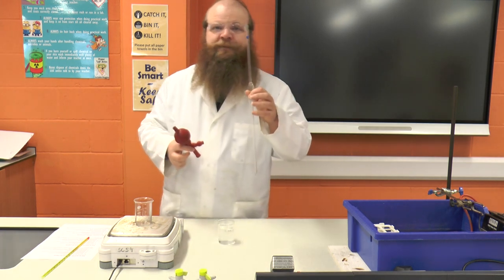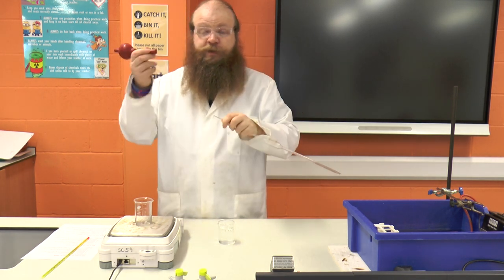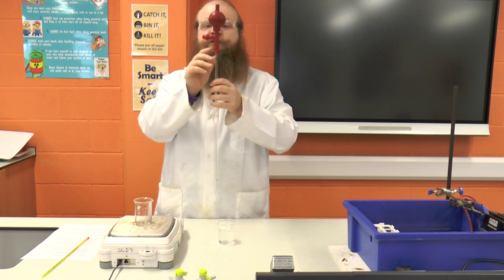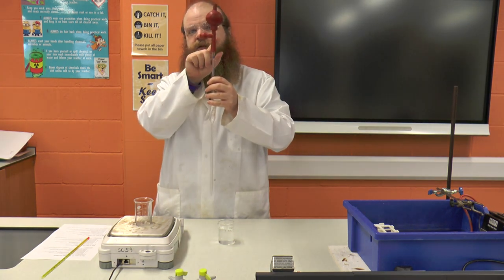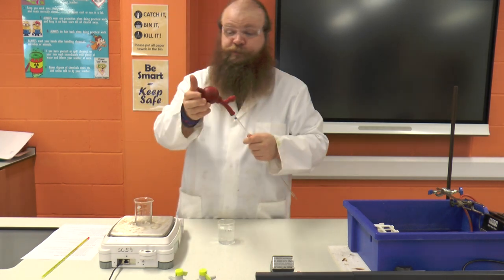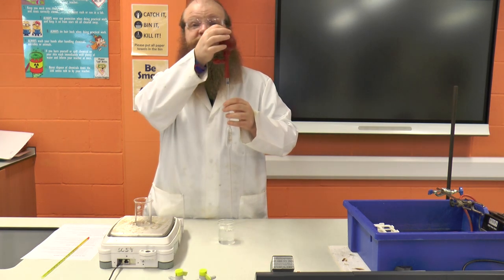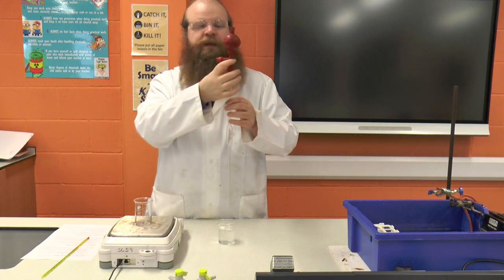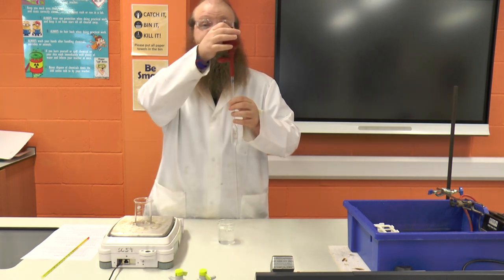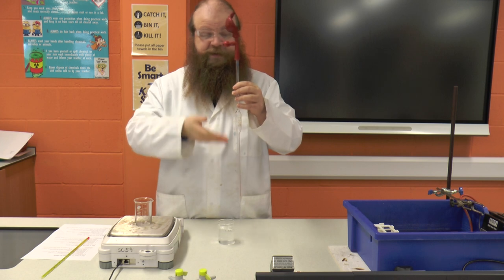We're then going to take our pipette and very carefully hold it at the end nearest where we're going to put the filler on, and place it into our pipette filler. It is only going in until you feel resistance — you must not push it up to the join with the side pipe or above, otherwise it will not work correctly and will damage the pipette filler. The pipette has three marks on it: A, S, and E. A is for air, for getting the air out of the ball. S is for sucking up the solution into the pipette, and E is for emptying it. They're little buttons so you squeeze on the letter. We're going to squeeze on the A and squeeze all the air out of the pipette filler, and then it is ready to suck the solution up.